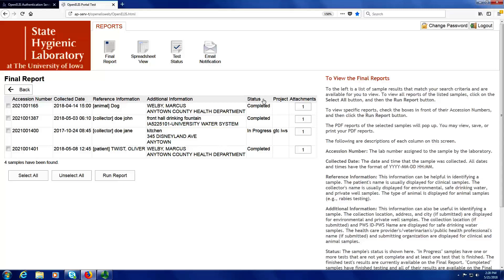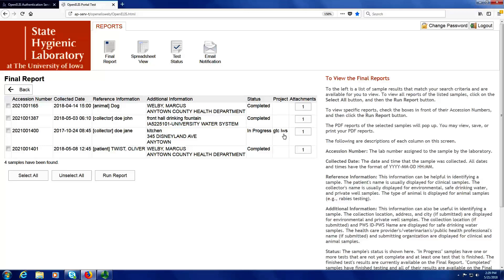The status column shows whether the entire sample has completed testing or is still in progress. If the sample has a status of completed, then all of the tests have been performed. If it has a status of in progress, there is at least one pending test remaining, but also at least one test that has been completed and has results available for the sample to show up on the final report screen. If the sample has been assigned to a project, the name of that project will be shown in that column — so for the third sample, it has been assigned to the GTC IWS project.